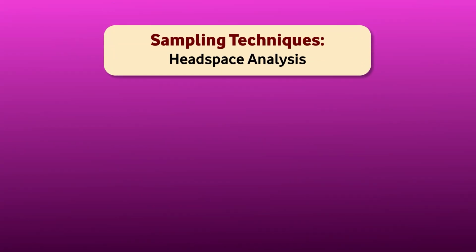Now remember, we are doing microanalysis. The constituent that we are going to analyze is in very, very trace amount. So many times we are not able to reach the low LOQ and LOD of the equipment. We can't go low. So we have certain sampling techniques. The most common sampling technique these days is the headspace technique.